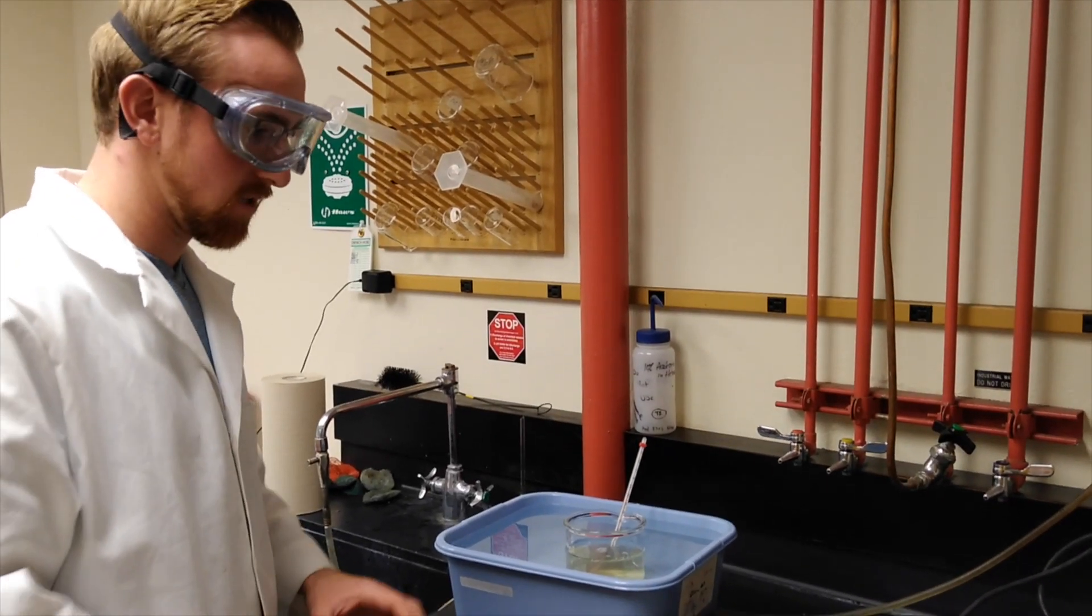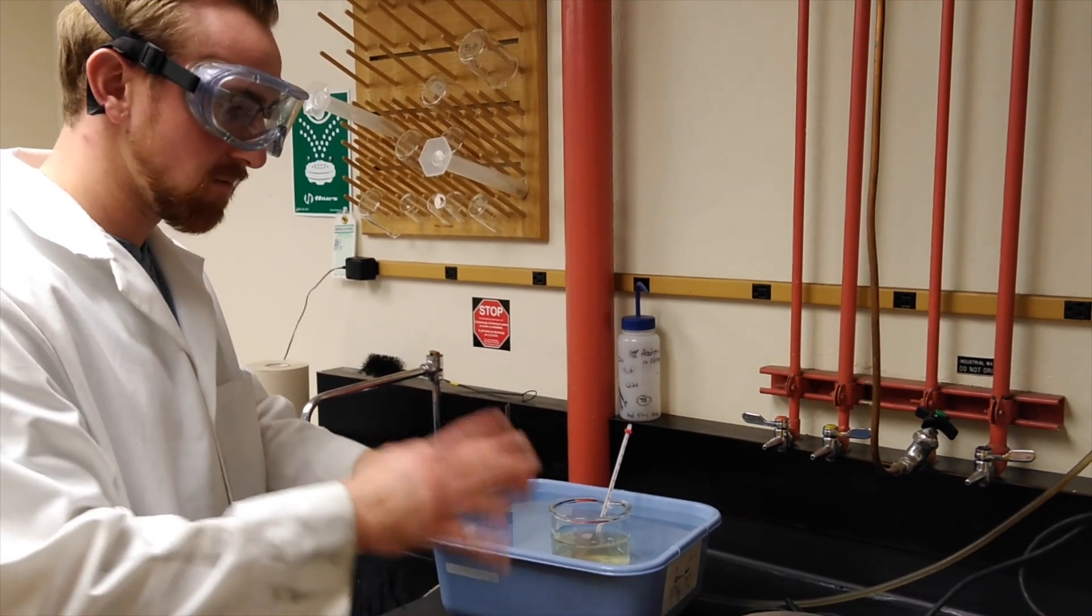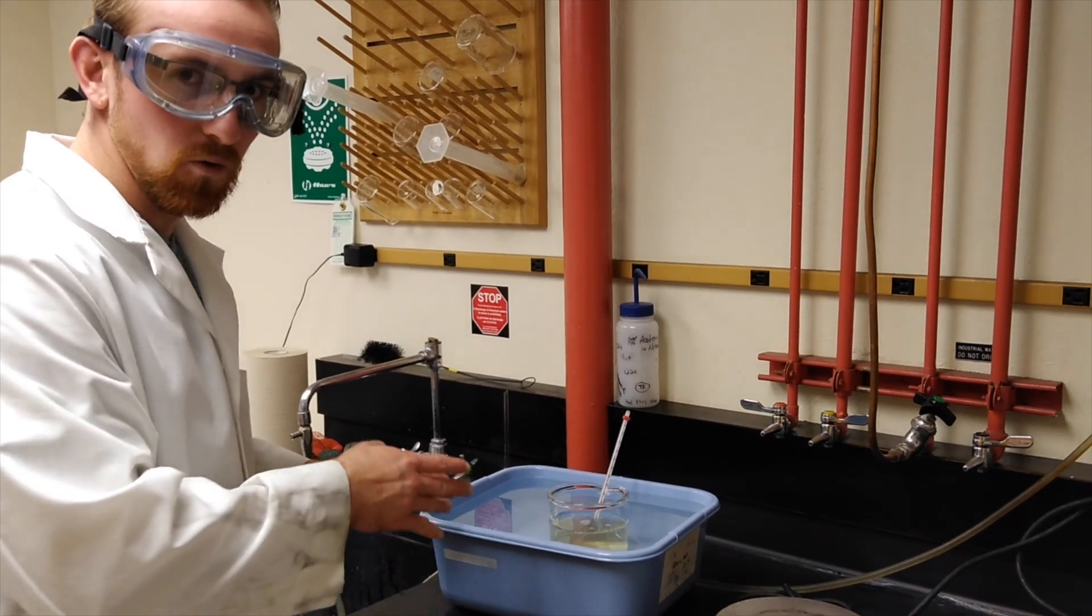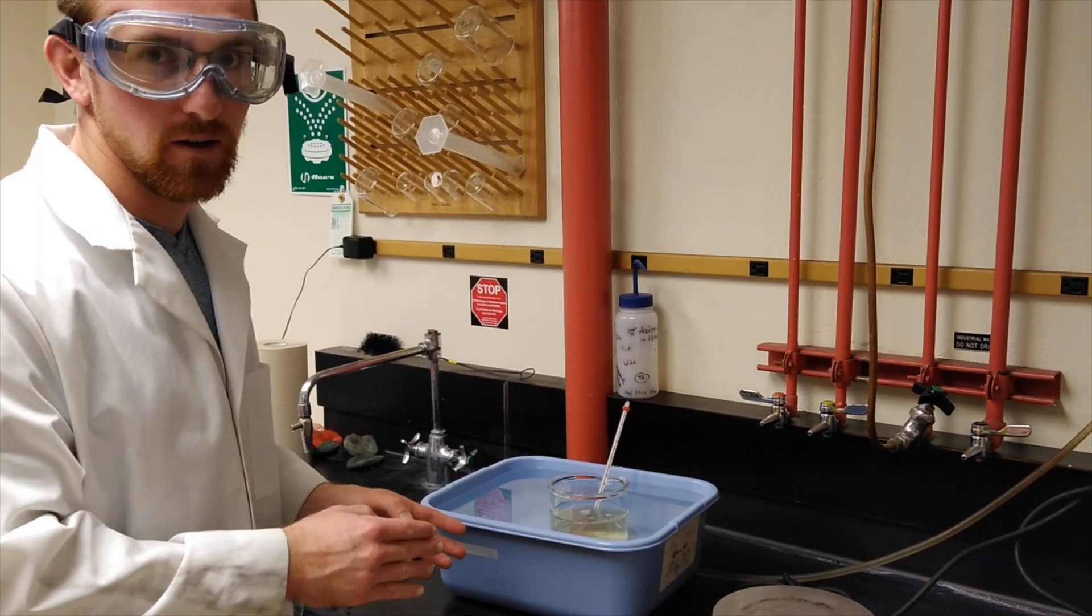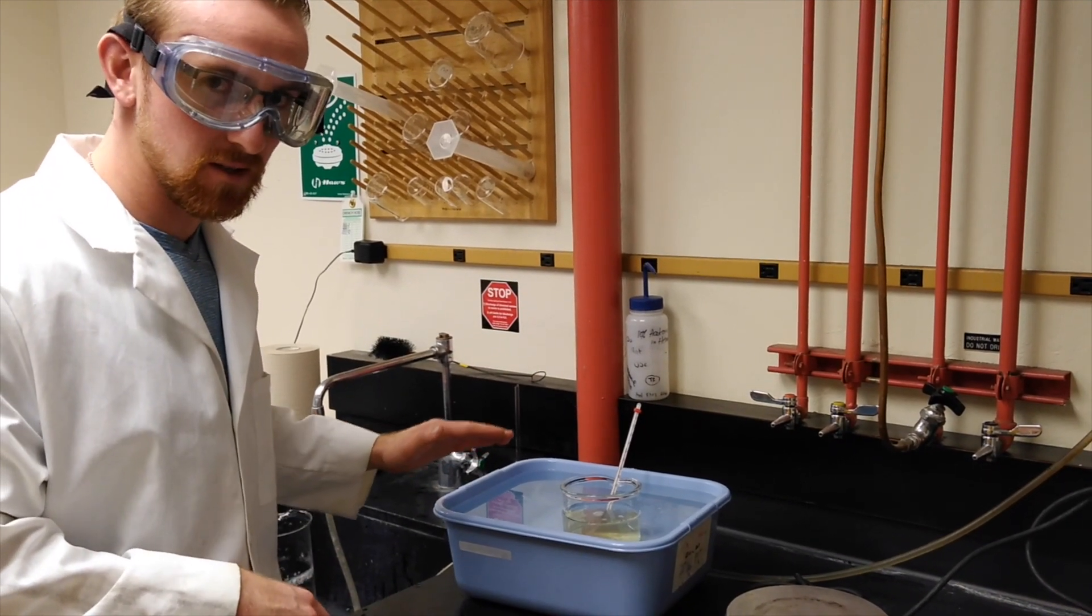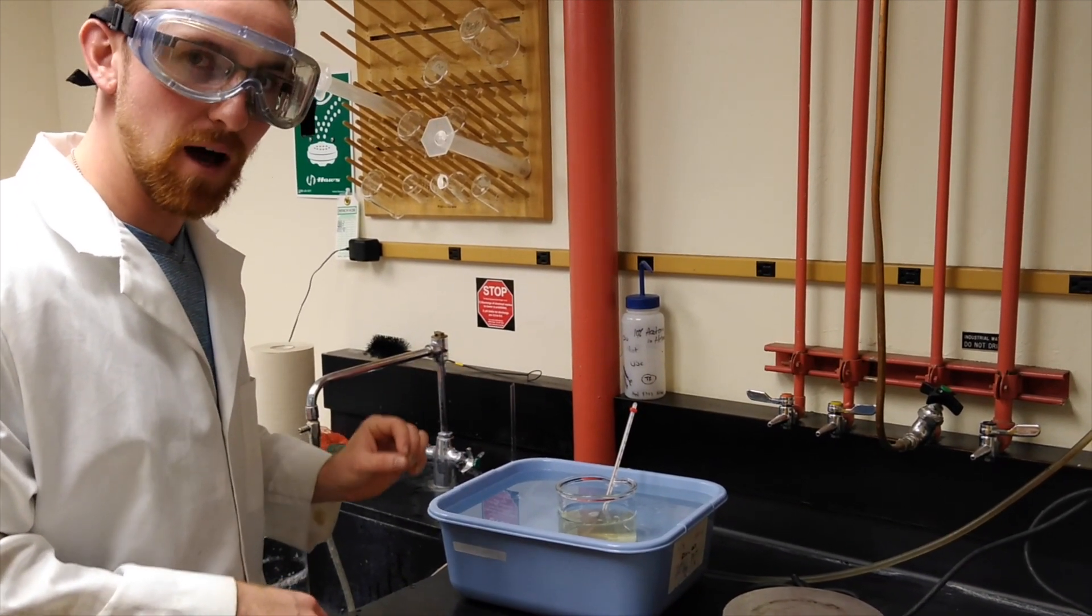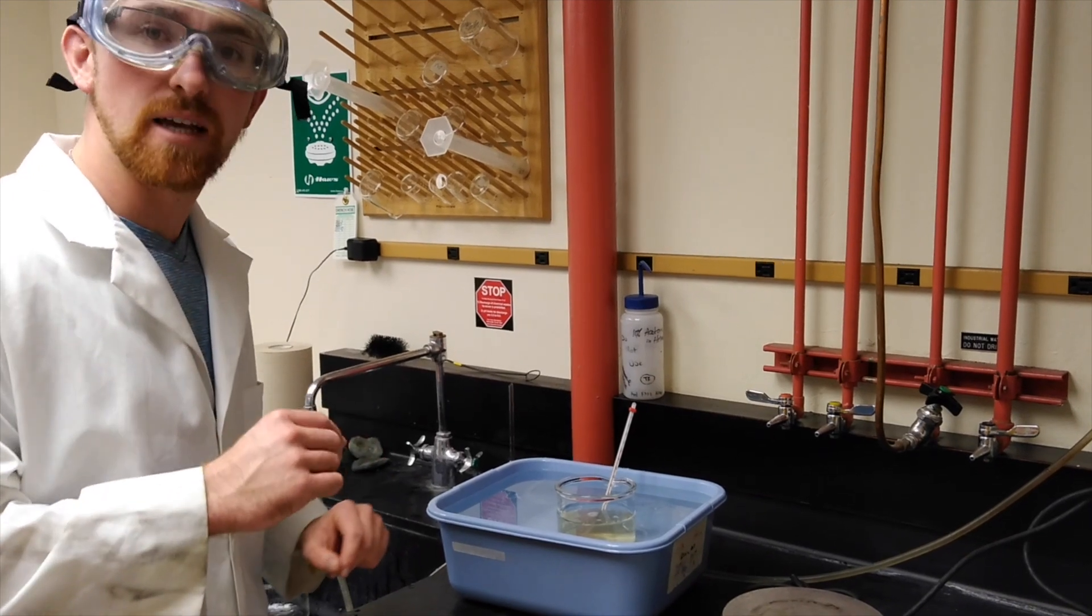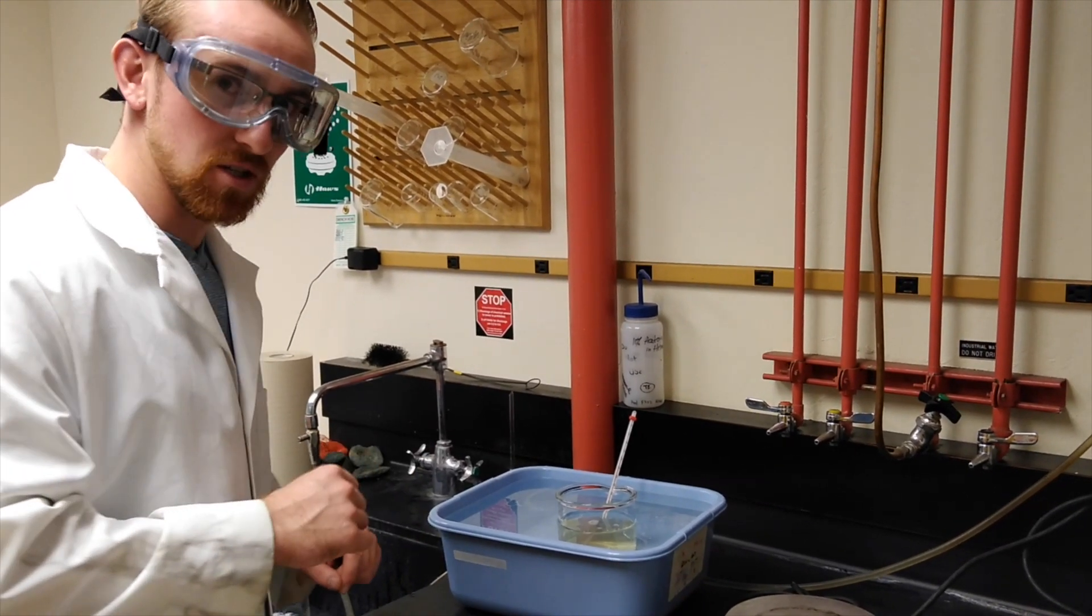So now what we have done is we have transferred our sugar solution from the hot plate into a cooling bath. What we're trying to do here is limit the amount of time needed for crystallization. We will lower the temperature to 70 degrees Celsius, and then we'll remove it from the cooling bath and insert our nucleation site to begin the crystallization process.